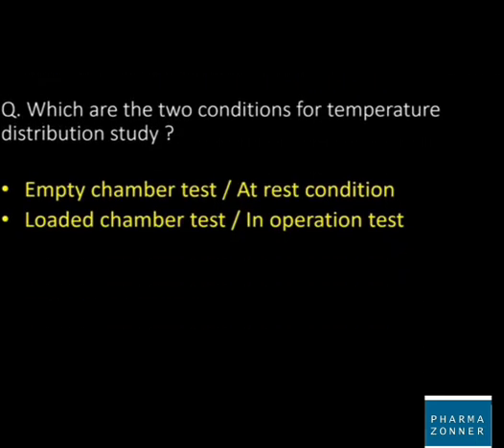Next question: which are the two conditions that are normally considered during temperature distribution study? In case of chamber temperature distribution study, we consider two cases, that is empty chamber test and loaded chamber test. Whereas in case of processing areas, we consider two conditions, that is at rest condition and in operation condition.